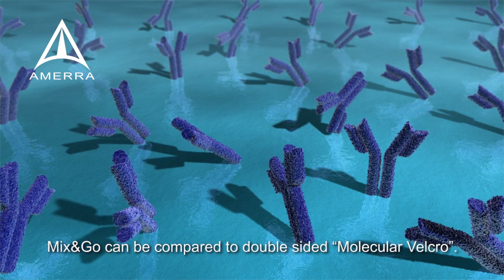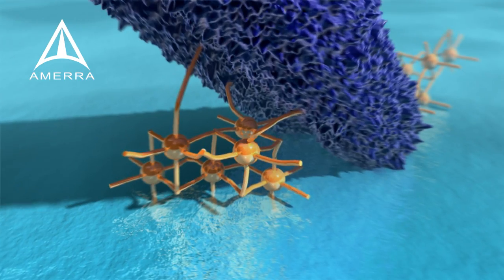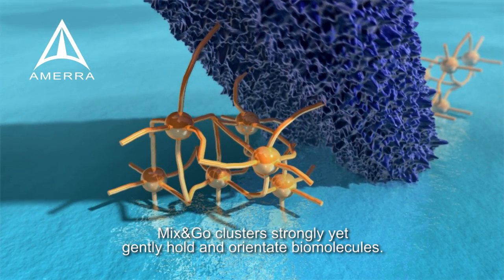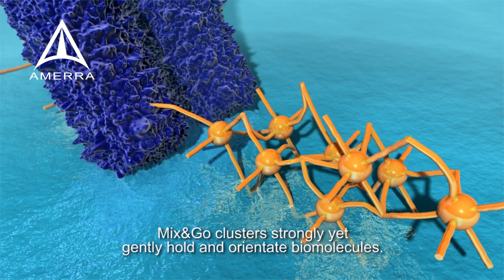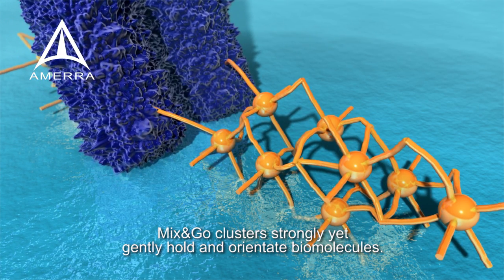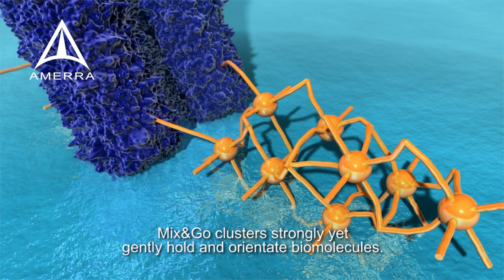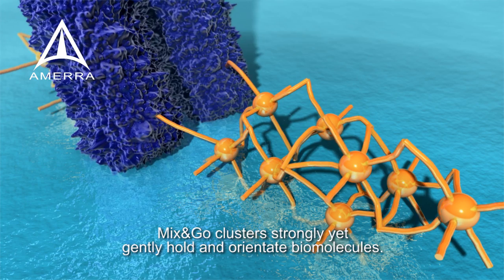We like to think of Mix & Go as a double-sided molecular velcro. In close-up, each of the metal ions can chelate at six points, allowing the formation of a polymeric cluster of metal ions. These clusters also form bonds with certain patterns on the molecule, holding it down strongly while allowing the molecule to maintain its native 3D structure. One chelation event is too weak to hold a large molecule, but together these clusters strongly but gently hold and correctly orientate the antibody onto the surface, which increases the number of available and active antigen binding sites.